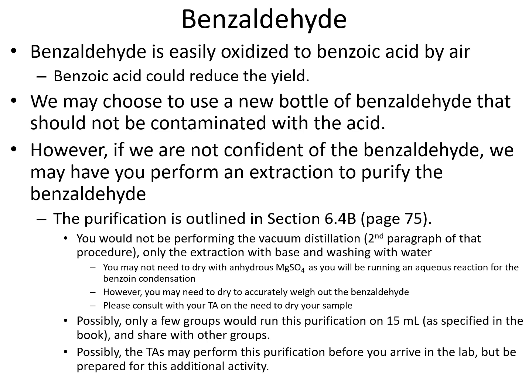It's not a complex kind of experiment. We just wash the benzaldehyde first with sodium bicarbonate. You just wash it in a separatory funnel with frequent shaking, and then you wash it with water, and then after that you can dry the product using magnesium sulfate, and that's how we wash the benzaldehyde.